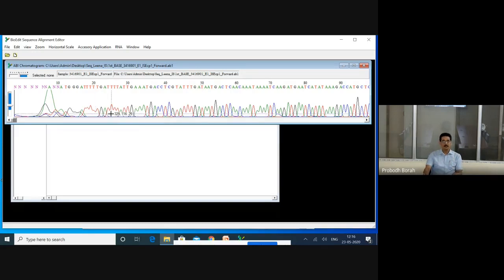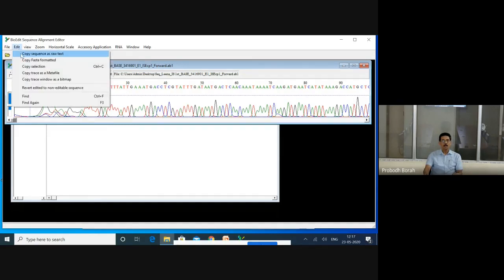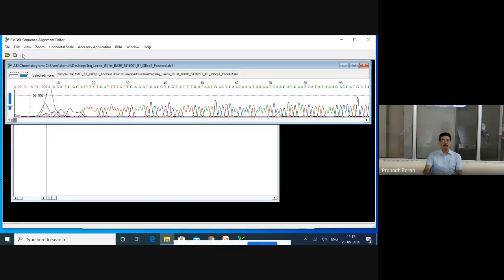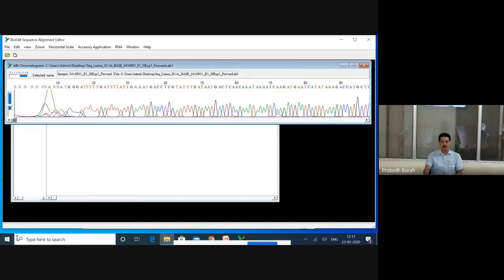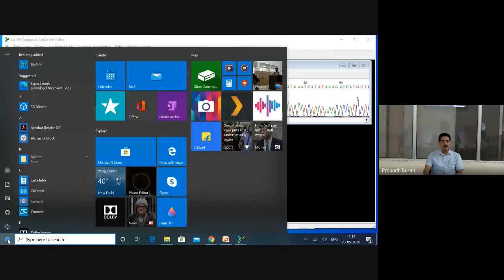Now it is ready for editing. In the first step, go to Edit menu, then click 'Copy sequence as raw text'. The raw sequence as represented by the chromatogram will be copied from this file into the computer memory. Now we will use Microsoft Word for editing the sequence alongside BioEdit, because it is easy to handle. Open a Word file from the programs.